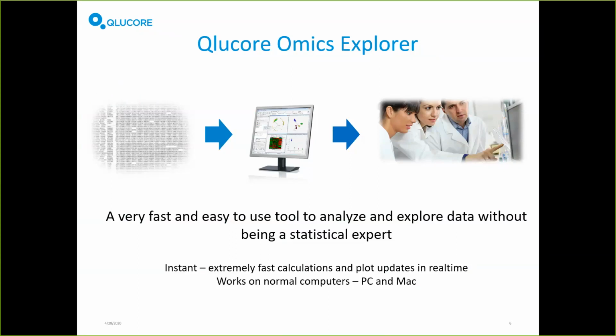Also, Qlucore Omics Explorer is different than many other software packages and offerings out there because it's instantaneous. It's extremely fast. It's interactive. So you actually interact with your data and you see your data on the screen while you are performing analysis on it.